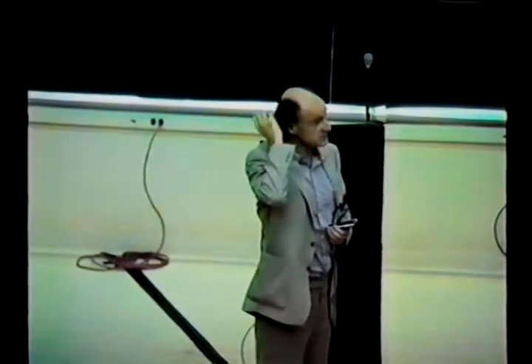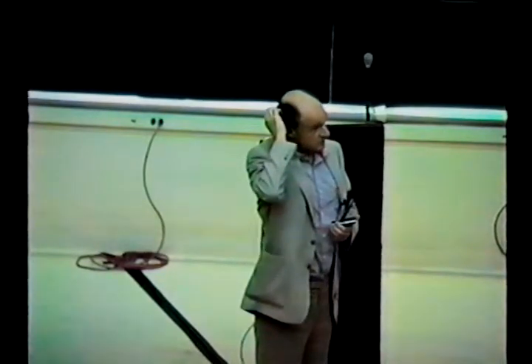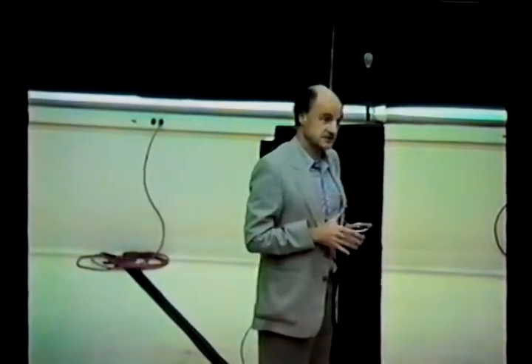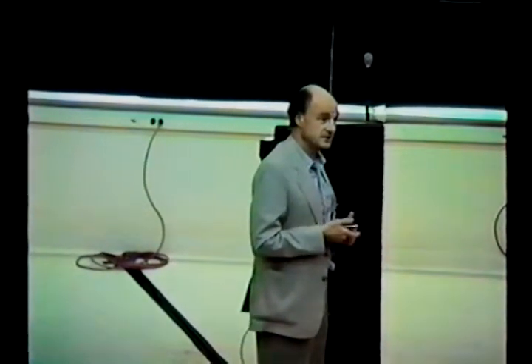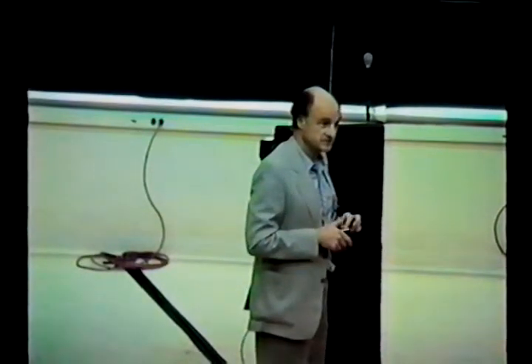There are considerable difficulties in using diffraction, I think, to look at the structure of ice, because you're measuring coherent scattering, and you've got all the problems of removing the background of the silica. So I would say that possibly looking at the inelastic modes at low energy could be more valuable. But you're right, yes, they have been looking at water, of course.